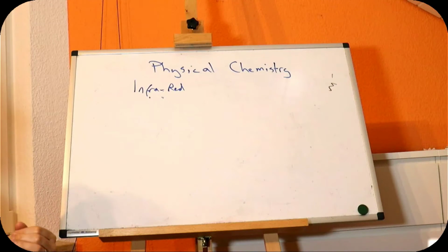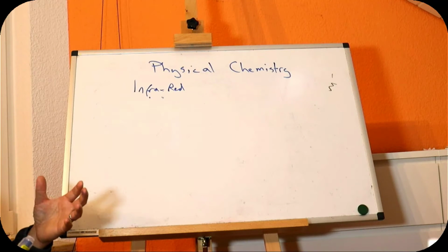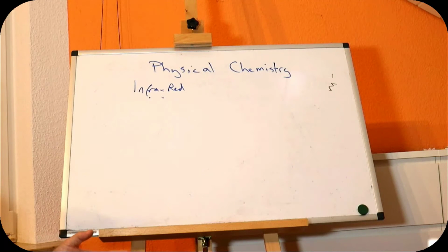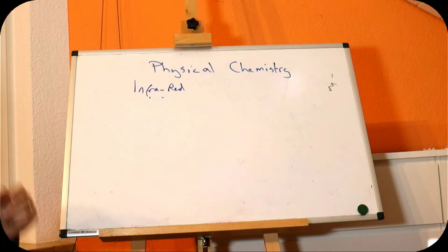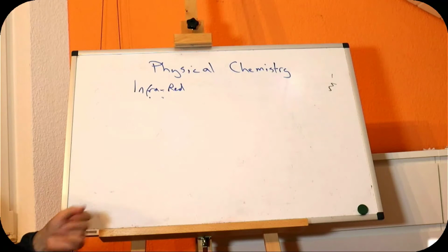I said I was going to keep the mechanism for a different time, but I lied a little bit, because we need that just to explain why we do what we do. So because the infrared is going to be measuring bonds, it will be difficult to use something with bonds in it as a container.